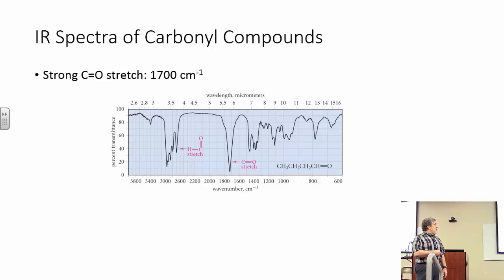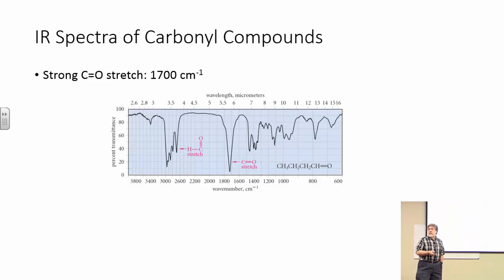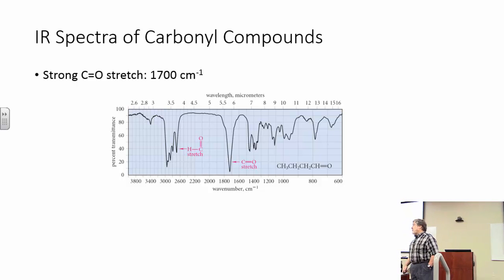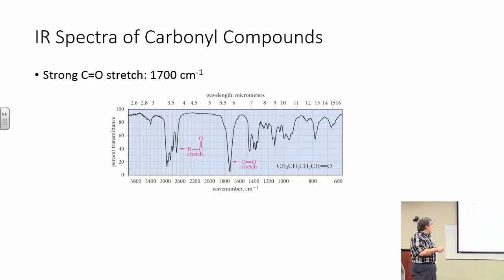So the compound that you're seeing the IR for is this one here. Looks like butanal. And in particular, it's an aldehyde, right? You know an aldehyde is different from a ketone because of the hydrogen that's attached to the carbon that's double bonded to the oxygen, right? Aldehydes have a particular extra peak that ketones will not have because of that H. And it's right there. Something to keep in mind. It's a way to tell the difference between aldehydes and ketones. That's just about 2,700.